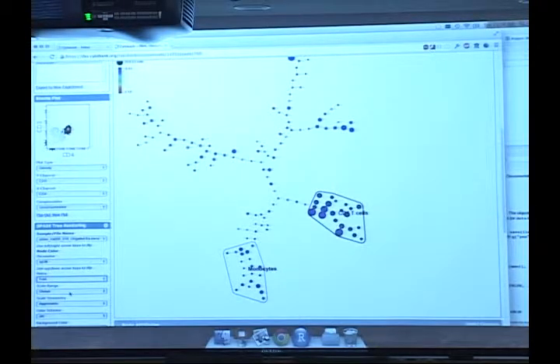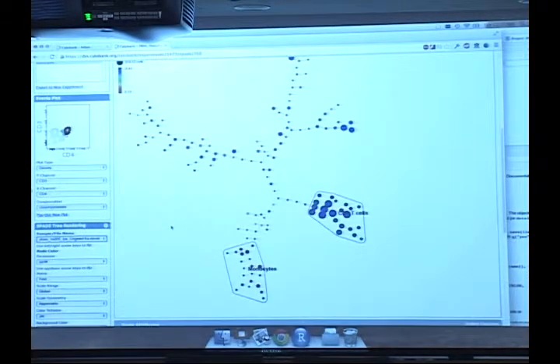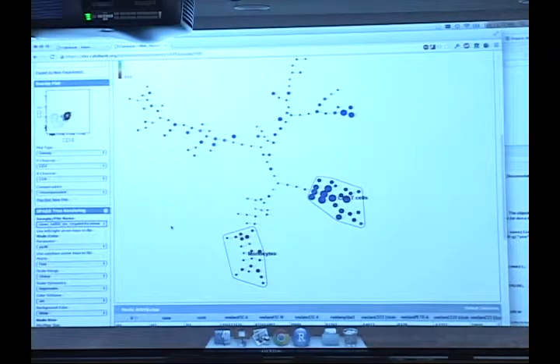We want to compare the levels of these things relative to our unstimulated state. But instead of looking in the unstimulated files, let's look at these things in our LPS stimulated sample. So here's LPS stimulation. We're looking at the levels of phospho-P38, and we're comparing the fold change versus baseline.